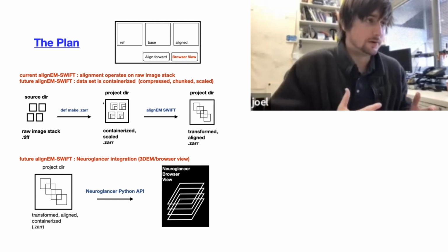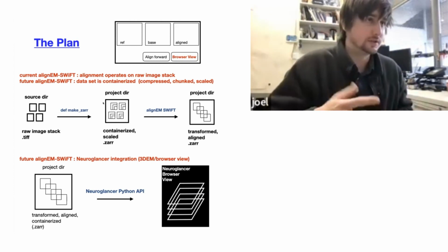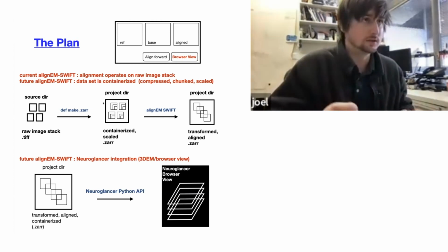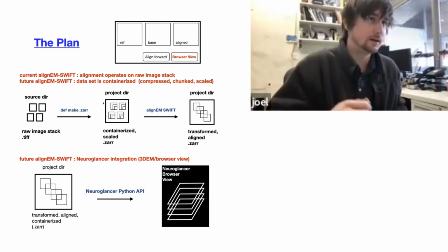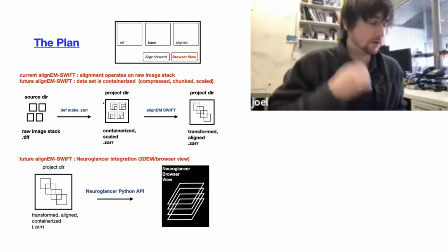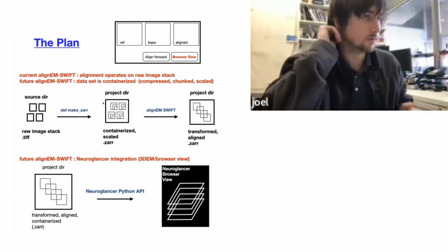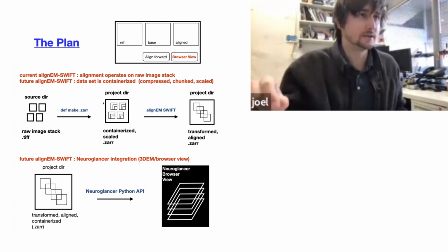And then there's different container technologies. A container is going to let you put the images into this container, and it's literally a directory you can CD into from the command line, and you interact with it like it's a directory, but it's got metadata associated with it. The metadata can contain information about the project, or whatever we want it to. It can have like the scale, and there are several of these files. .zattrs is going to be the Z attributes file.